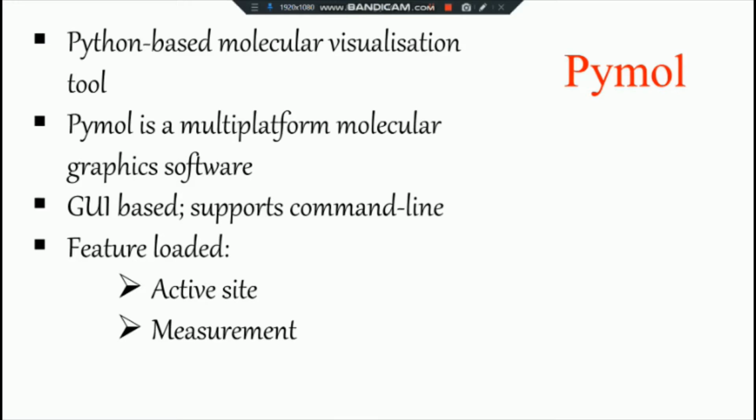The other thing that we could do with Pymol is measuring the hydrophobicity or hydrophilicity of the molecule. It could be done by generating the electrostatic potentials. Hence, Pymol is not merely a visualization tool, but one could also easily use the features which are there in Pymol.